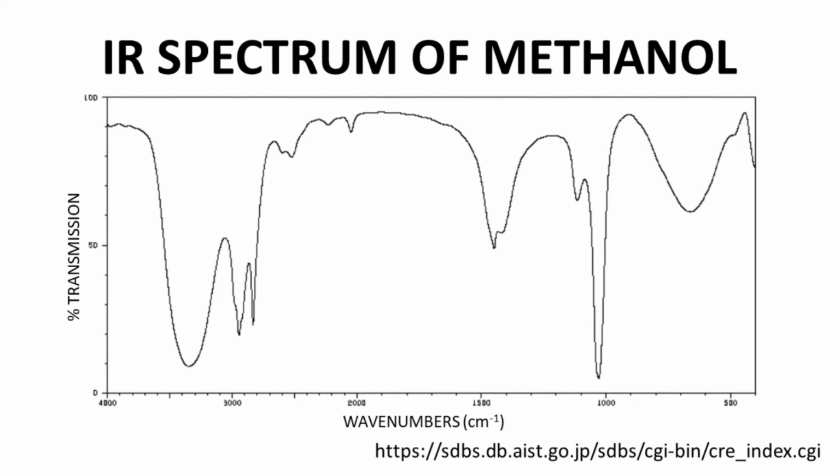The absorbances are referenced based on the x-axis position of the bottom of the dip, the bottom of the absorbance. We have a number of absorbances in this spectrum. The deeper dips are said to be strong absorbances. The shallower dips are said to be moderate or even weak absorbances. Not all absorbances can be interpreted and assigned to a functional group. The strong absorbances in this spectrum can be assigned.